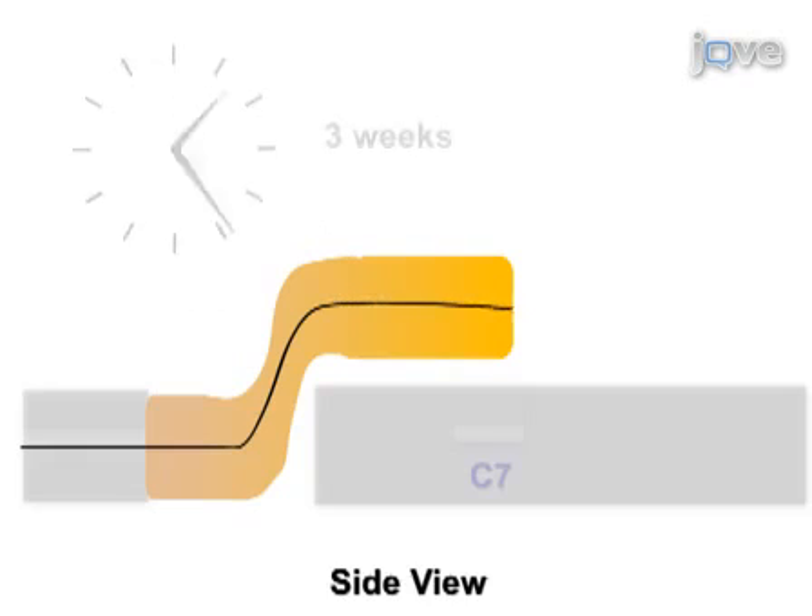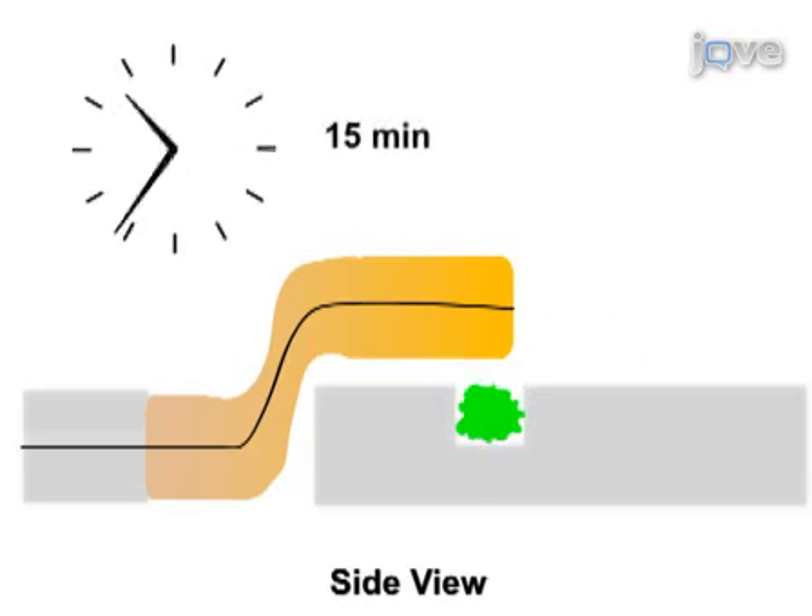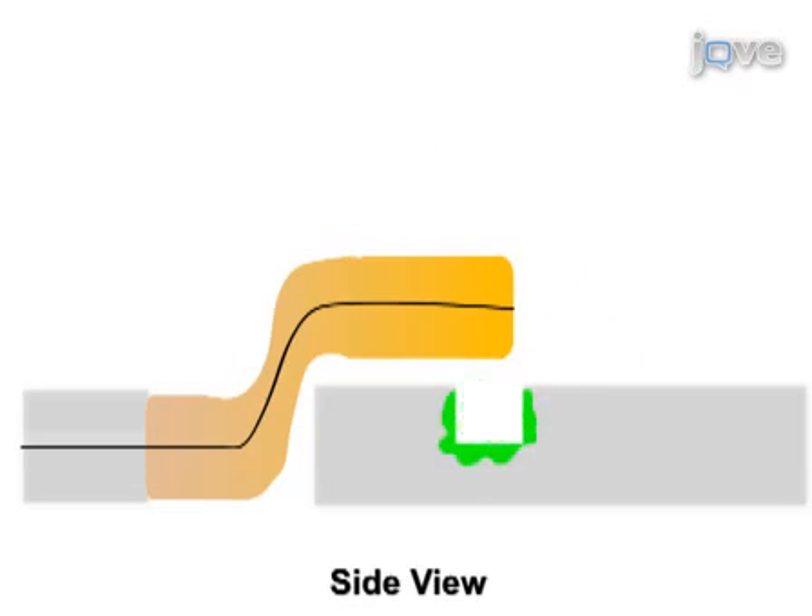Three weeks later, a dorsal quadrant lesion is made at C7. Gel foam saturated with CHABC is placed into the cavity for 15 minutes to digest proteoglycans of the glial scar. Two days later, CHABC is microinjected adjacent to the lesion site, and the distal end of the PNG is opposed to the dorsal quadrant lesion.